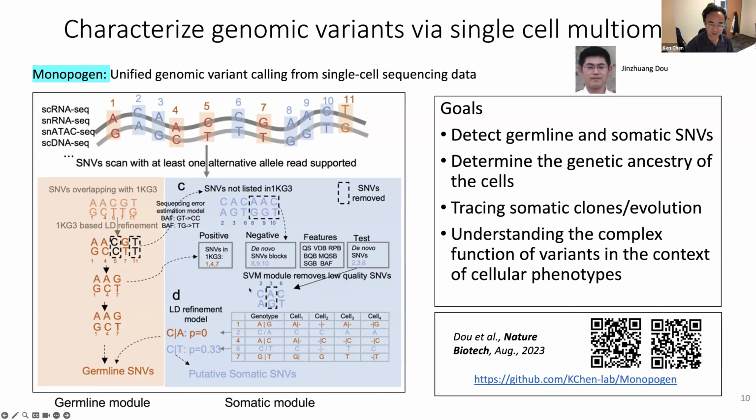A more challenging task is to identify somatic mutations, which do not exist in the reference and are potentially plagued by different types of error, both sequencing and DNA amplification errors, as well as different levels of contamination or different clones being mixed together. The statistical approach we're using here examines relatively high coverage regions of the data and reduces errors through different machine learning modules that remove low quality locations, and leverages the linkage disequilibrium (LD) structure in the data. If there's a somatic mutation, we can tell that it only affects one subset of the cells and consistently exists on one of the alleles.